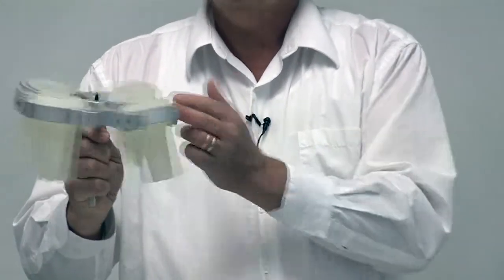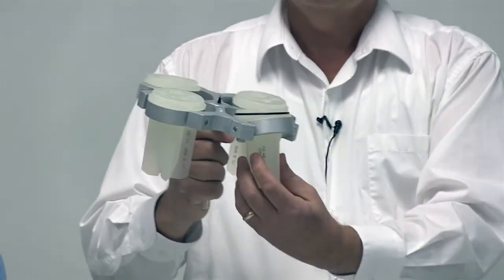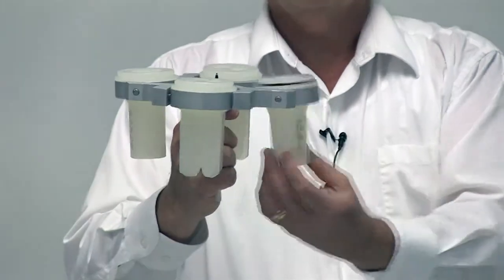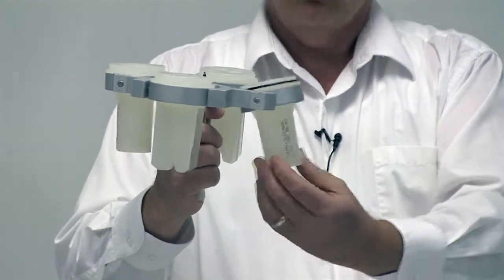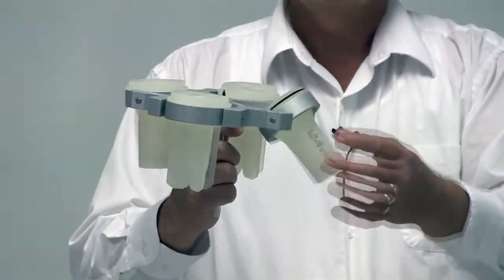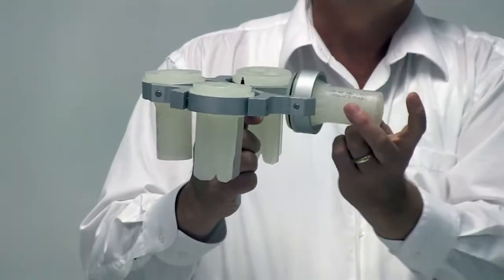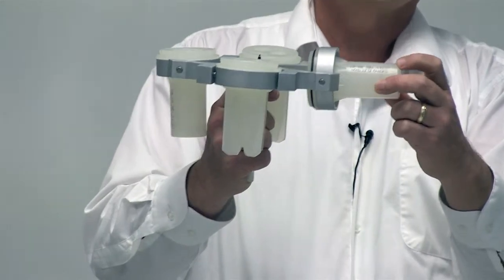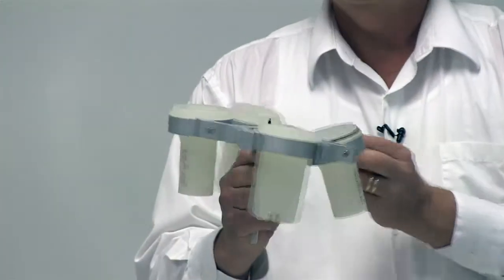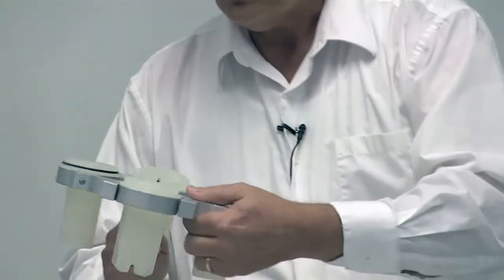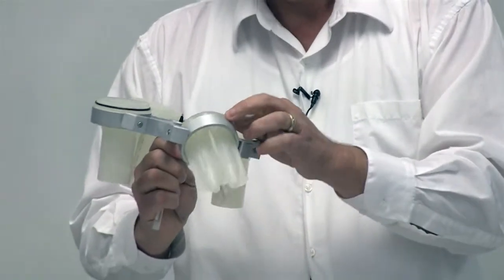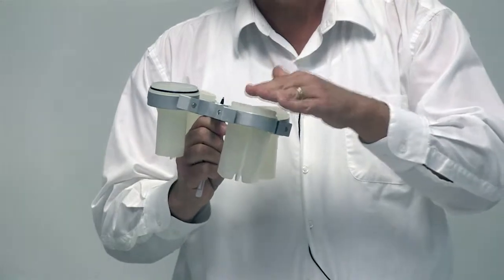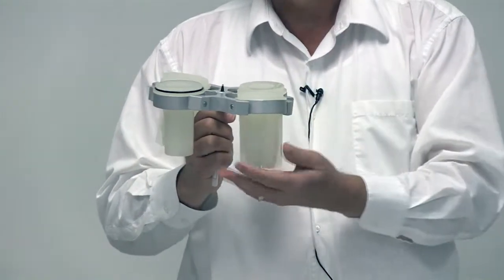You can see this is a swinging bucket rotor. As the rotor begins to spin, the buckets actually swing out into the horizontal position from their resting position of vertical, so that the force being applied centrifuges and pellets the material into the bottom of the tube. And that's the purpose of the centrifuge: to apply this force to sediment the materials.